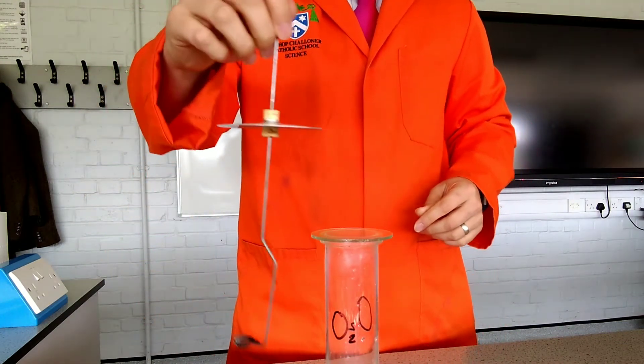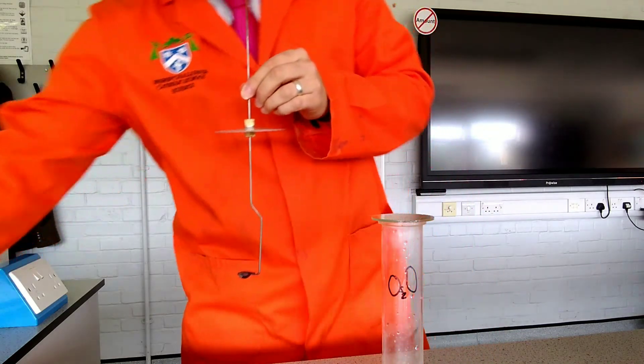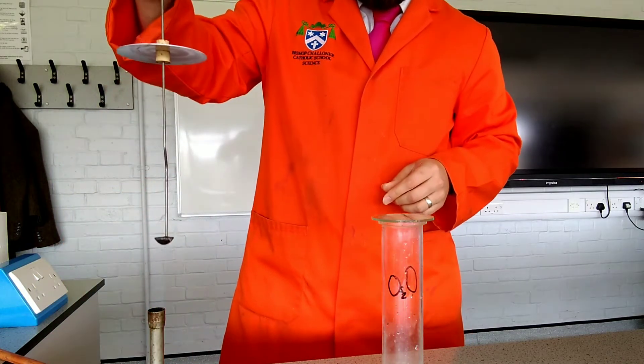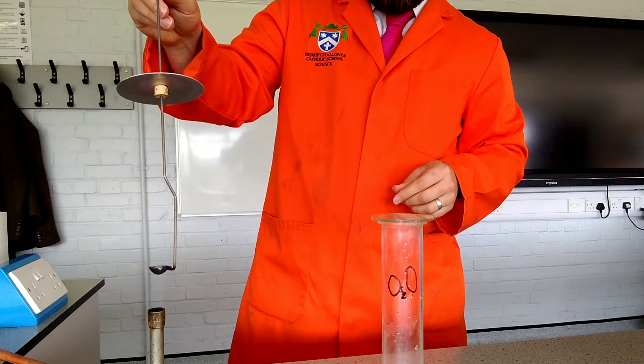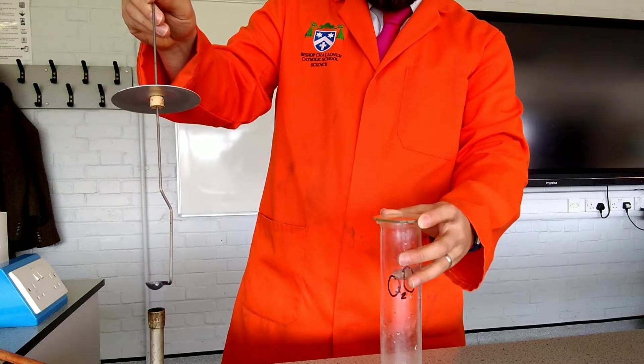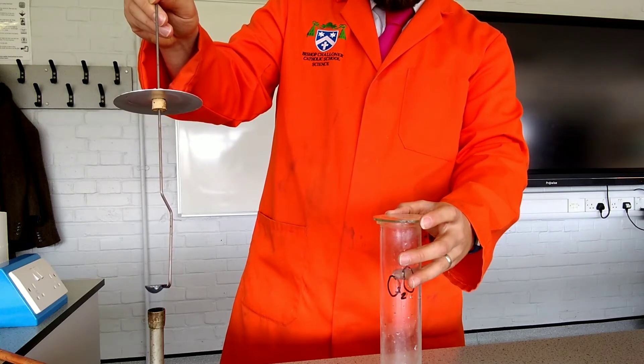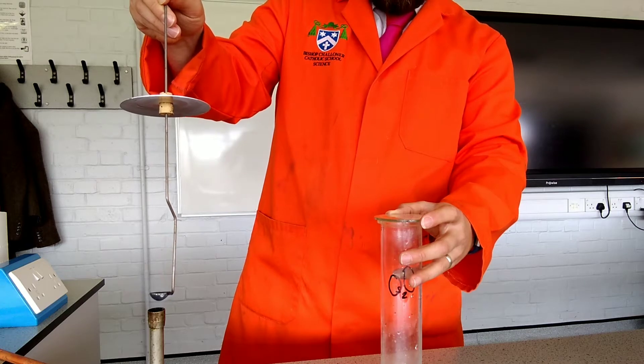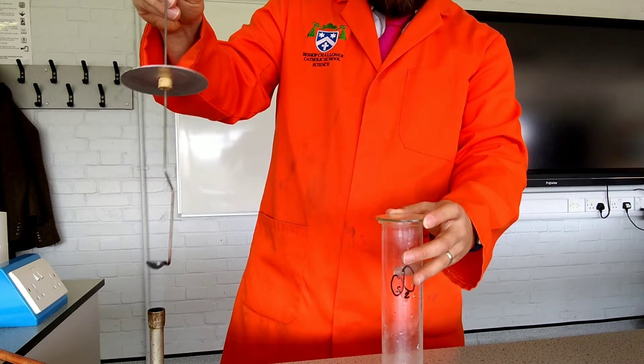So what I'm going to do is I'm going to sit this spoon inside this jar of oxygen gas, and as I do so, I'm going to set it on fire, or attempt to, and then I'm going to let it burn in the oxygen. So here's copper. I'm just going to heat this up to see if I can get my copper to react with the oxygen. And once it starts to react with the oxygen, I can remove the lid here and place it into the pure oxygen. You might see a couple of little flecks of green coming out. That's just a tiny bit of the copper burning. Copper burns with a green flame.